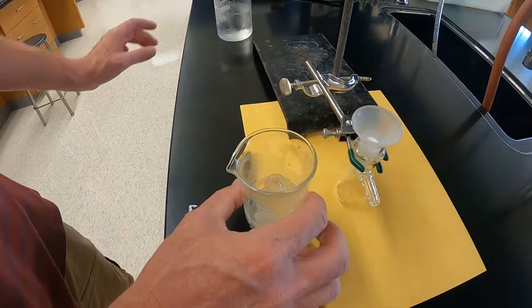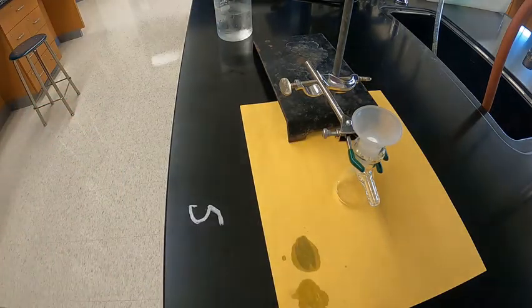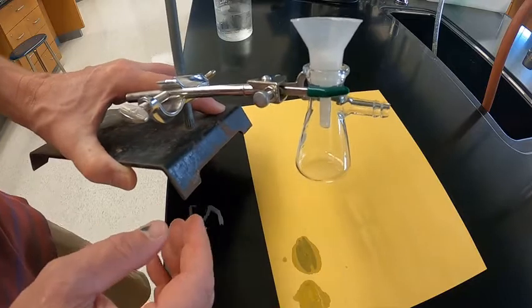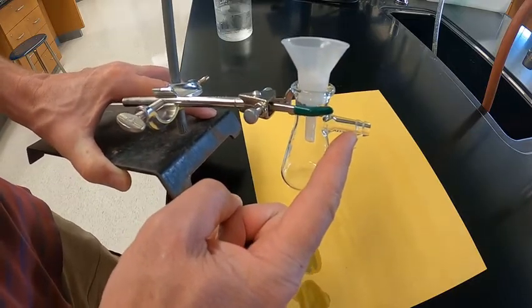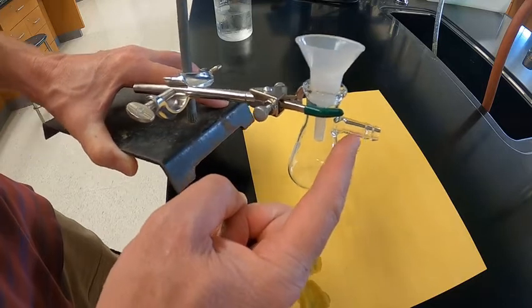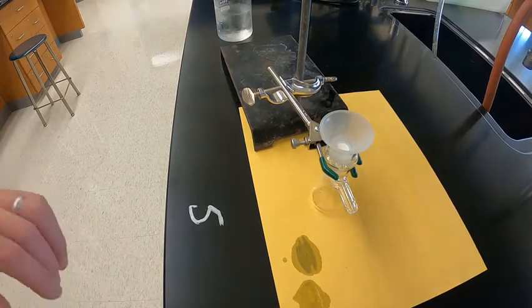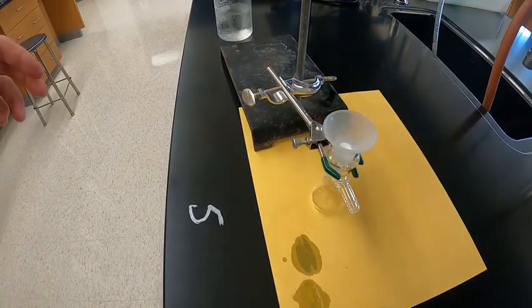I'm going to move this out of the way while I set up the Buchner funnel filtration setup. So in a Buchner funnel filter, what this has is a side arm, and that side arm can go to a vacuum line, and I'll zoom in on that in a second. And what that does, it allows us to vacuum things, to filter them more quickly than just letting it sit there and drip, drip, drip real slow.